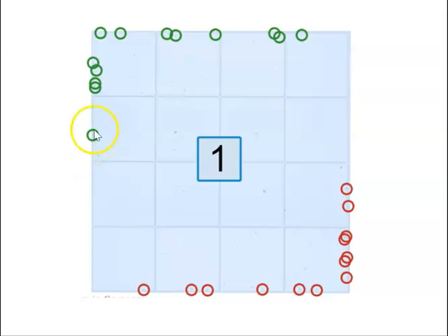So what we have done here is all the ones that are green, the grid line that's on the left-hand side and the grid line that are on the top, we are counting these cells in our cell count number. Okay, we've picked two sides and we're including these cells in our count. The cells that are in red on these two sides, the bottom and the far right, we are not including them in our count. So we're getting the closest average we can for our cell count without skewing too high or skewing too low.